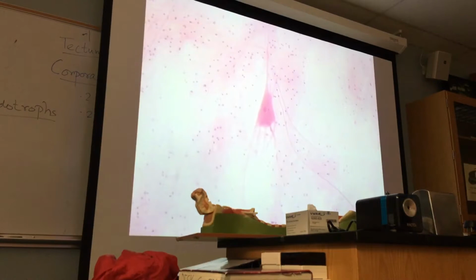You can see the neuroglial cells, plenty, many, forming about 90% of the neural tissue, and the neurons, they form about how many percent? 10%. Very simple. Look at the small processes. These are dendrites. This is the cell body. Very good. And this is the nucleus. But can you see one spot here? Is it danger? No, that is not an inclusion or anything, not the part of the cell body. That's a neuroglial cell that is stuck to it. You get that?